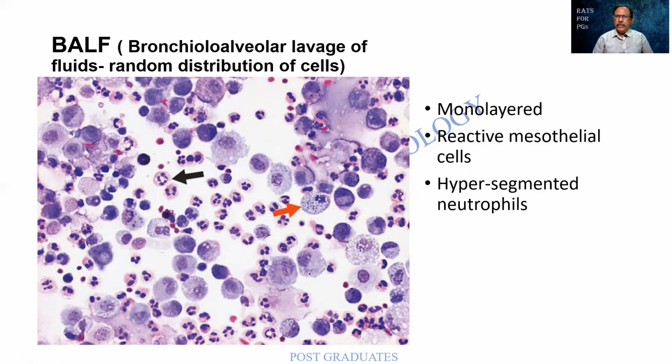I always used to tell the students, the difference between cytology and histopathology is, cytology is like preparing an egg omelette. You find that it is spread out, whereas histopathology is more like a cake or something. So here I find that the cells are well spread out. There is a nuclear detail, cytoplasmic detail, etc.